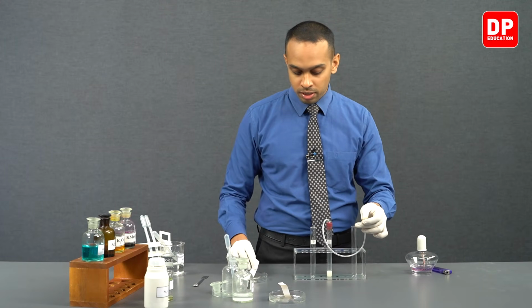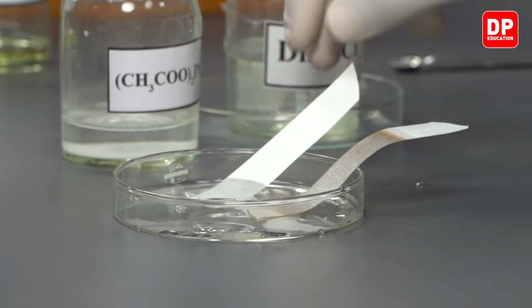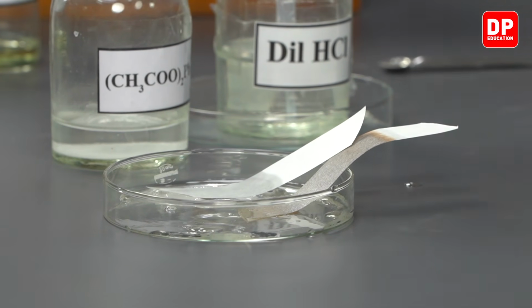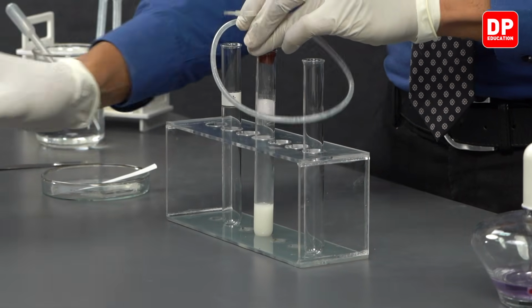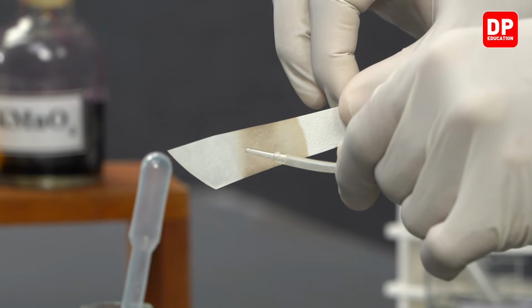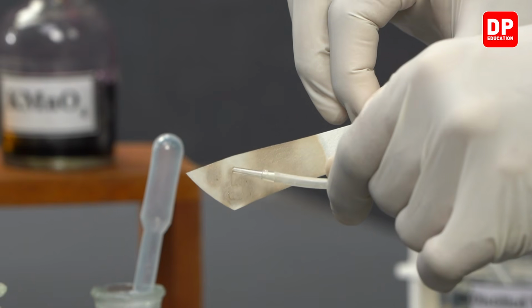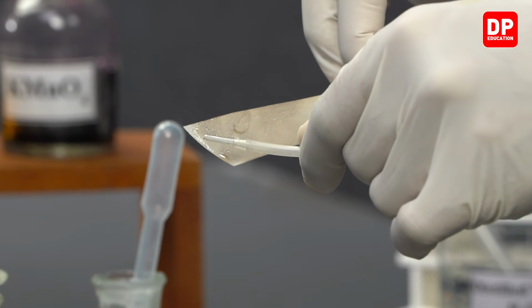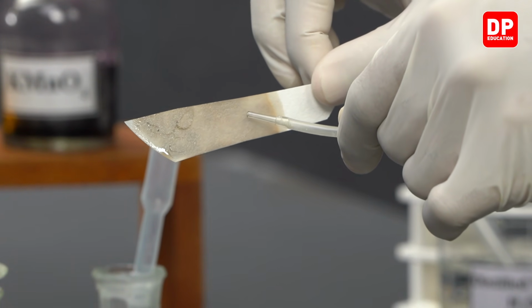If you want to observe it again, we can soak another piece of filter paper and add some HCl, and then we can see how the color changes as hydrogen sulfide comes into contact with lead acetate. Do you observe here how the color changes when the hydrogen sulfide gas is coming into contact with lead acetate?